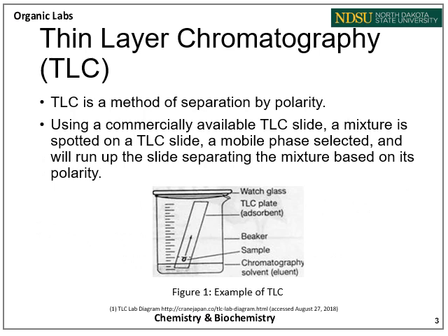The chromatography technique we will be using today is called thin layer chromatography, or TLC for short. TLC is a method of separation by polarity. Using a commercially available TLC slide, which is shown on the image below, a mixture is going to be spotted on that TLC slide. A mobile phase will be selected and will be allowed to run up the slide, which will separate the mixture based on polarity.